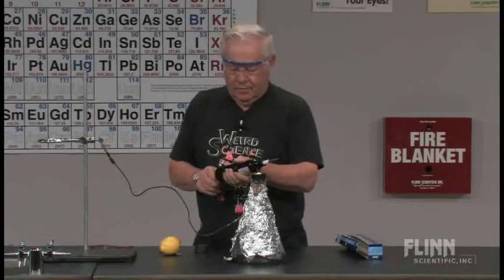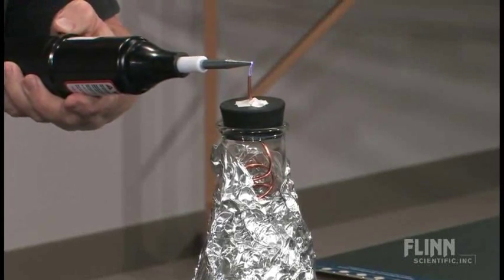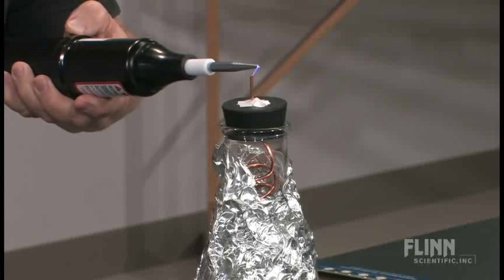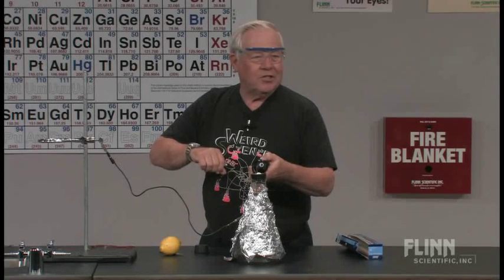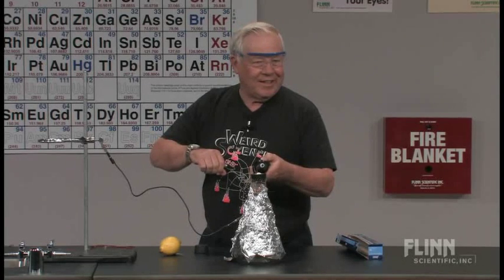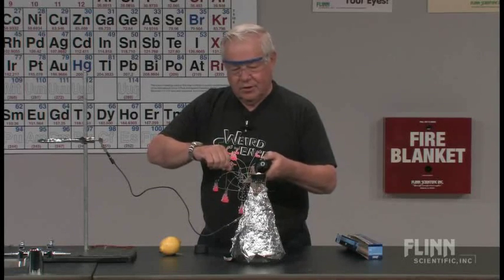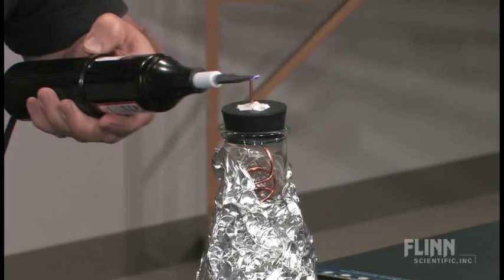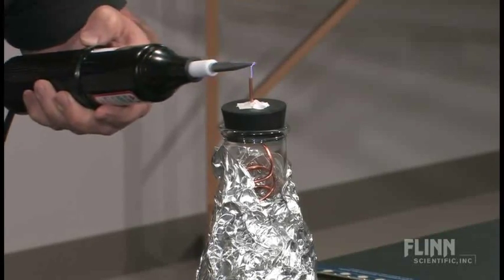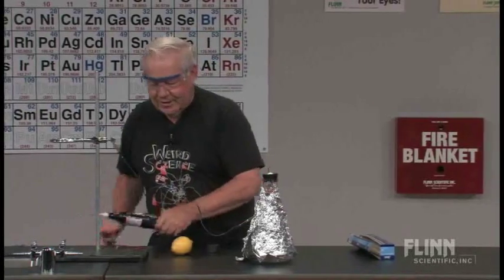So we're going to zap away. I really don't know exactly how long one has to zap — I generally zap 20 to 30 seconds to be pretty confident about it. Give it a little extra. Look at that energy. And I think we should have ozone in that flask by now.